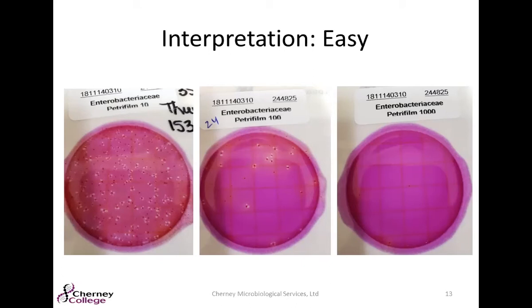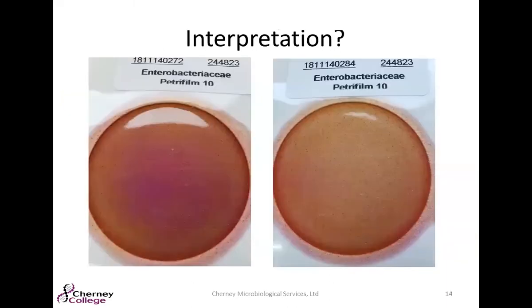However, there are some samples that can cause you some troubles. Particularly, I notice that environmental samples can be tricky to interpret. So that could show up as some of these options. If you're looking at these two plates here, you'll see that color change. So the plates are no longer purple, they're yellow. And to someone, they might interpret just looking at this 10 dilution as TNTC.